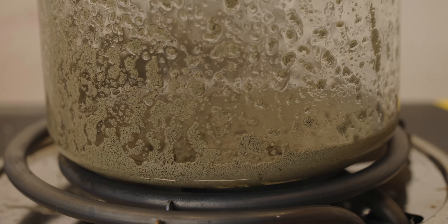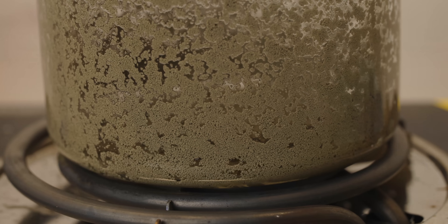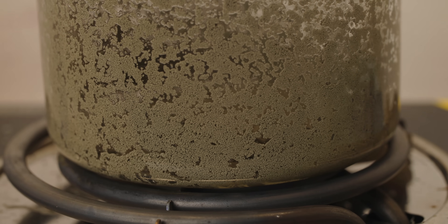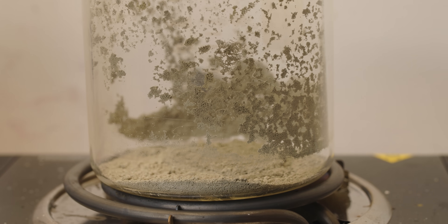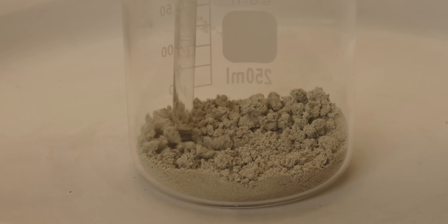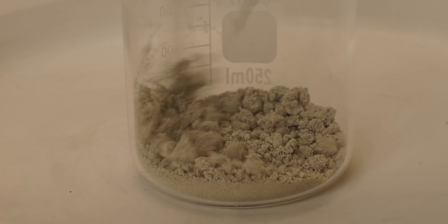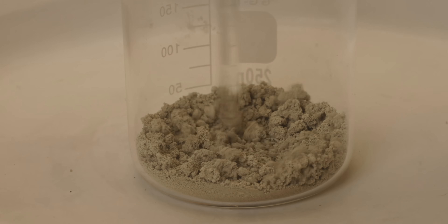Now that the silver has been neutralized, it's time to prepare for melting. Using low heat, I start to dry out the silver powder. As the beaker heats up, the silver on the sides of the beaker starts to fall to the dry surface below. This is pure silver powder, and like the gold previously, it's a medium of silver I've never seen or used before. I just can't wait to melt it down.